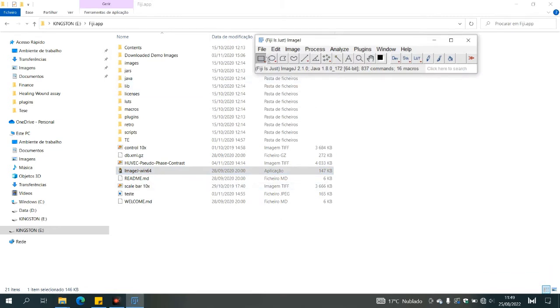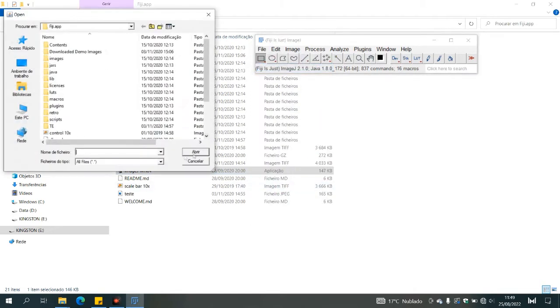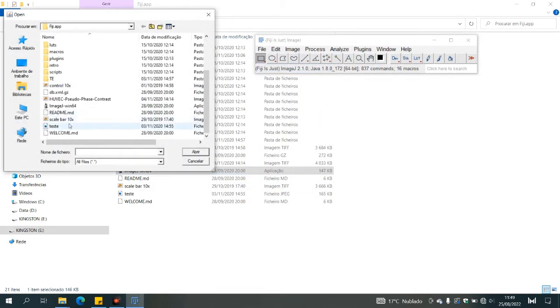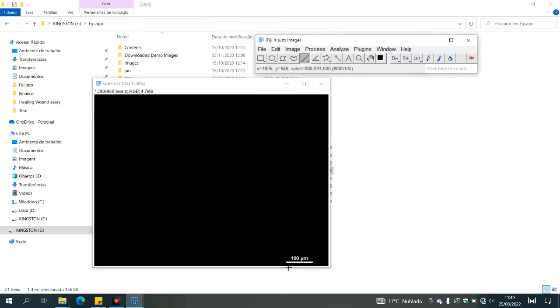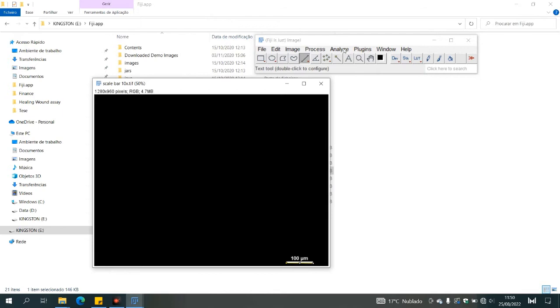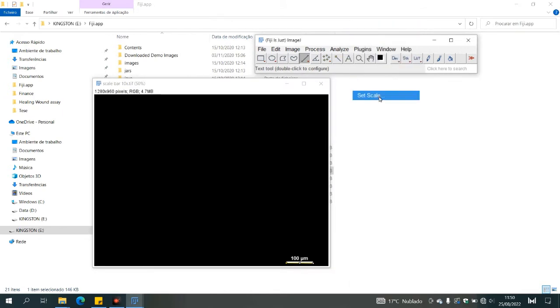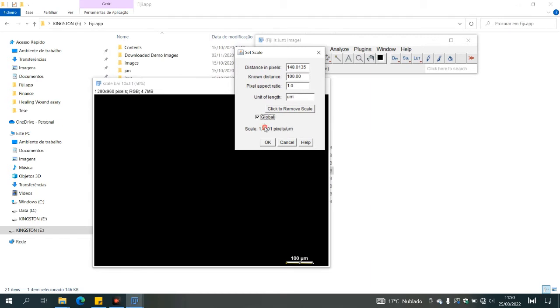you need to open ImageJ, then open a scale bar which corresponds to the scale in which your images were taken, then select the straight line tool and place it in the same length of the scale. Then go to analyze, set scale and substitute the known distance for the one in the scale bar and apply to global.